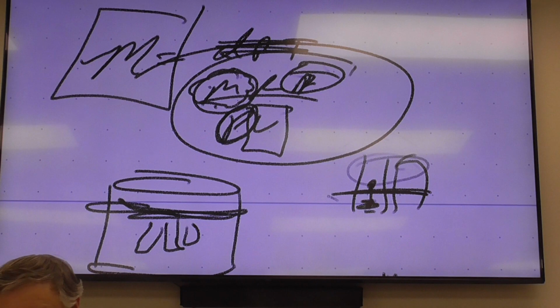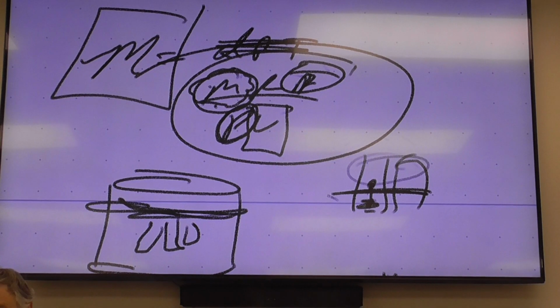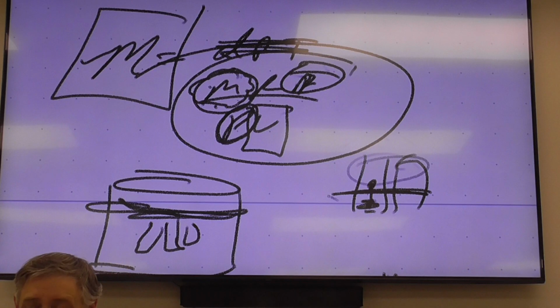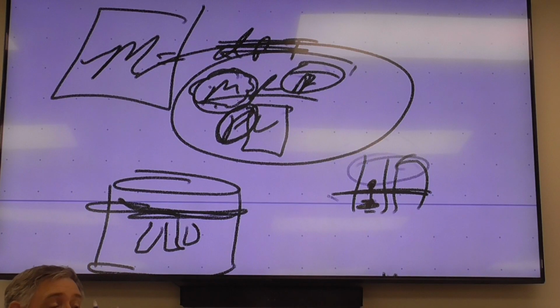What you're going to look at is, all this is kind of giving you an example. Over here on the back of page 1, it's got some sample data. On this sample data, you need to do this, okay, this is part of the lab. I emphasize this on another sheet of paper, you're going to do this.